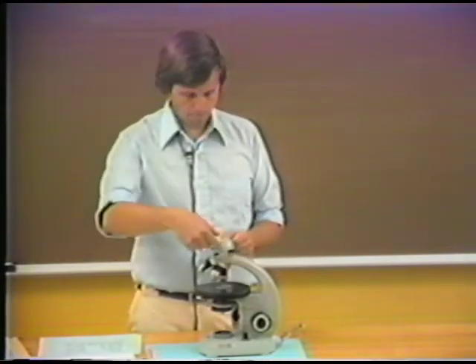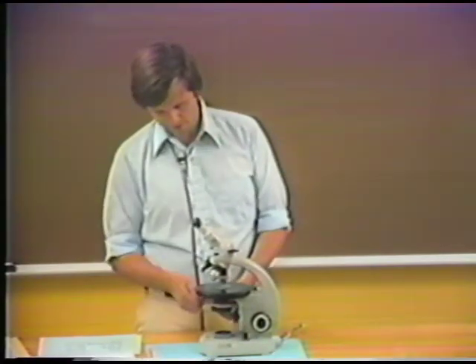We stop and we now remove the converging lens and the Bertrand lens of the microscope, and we look at the mineral now in crossed polarized light. And so now I'm looking at this particular quartz grain in cross polarized light. I haven't changed the position of the microscope stage, kept it in the same position. We know the isogyres left in the northeast direction, so we now know the position of the E vibration direction.